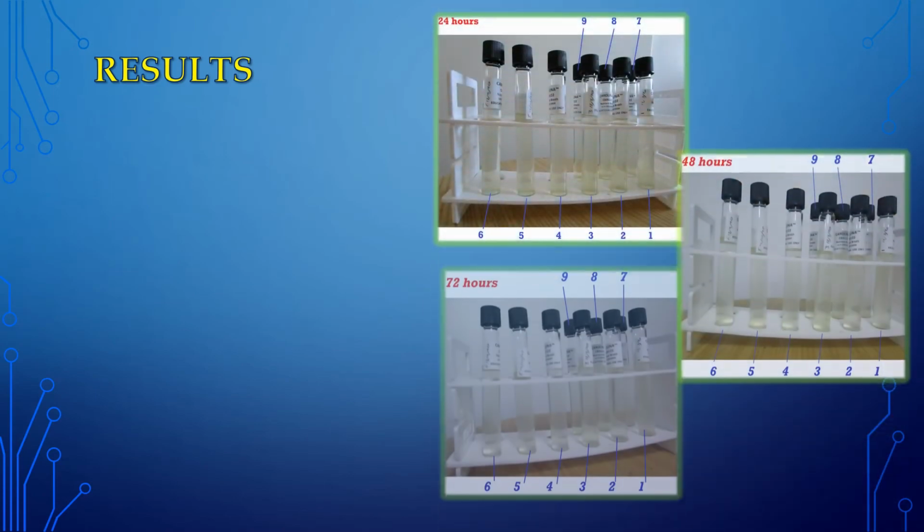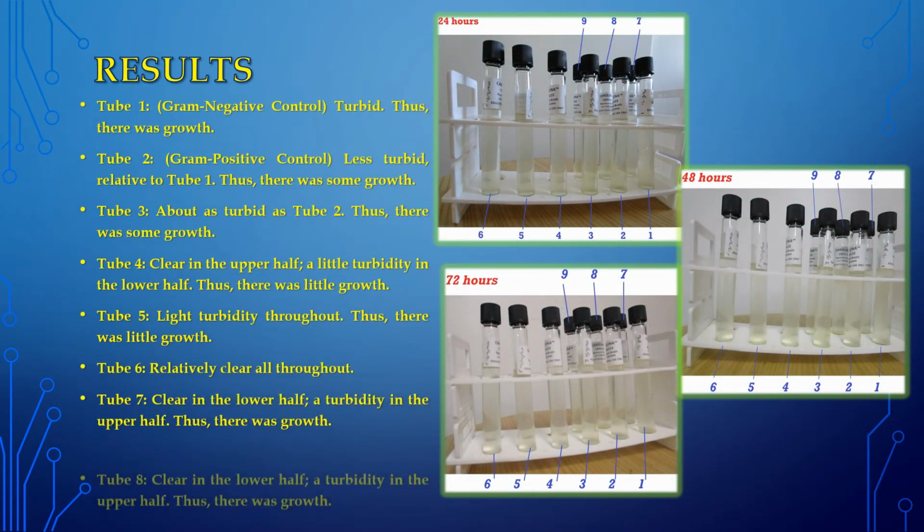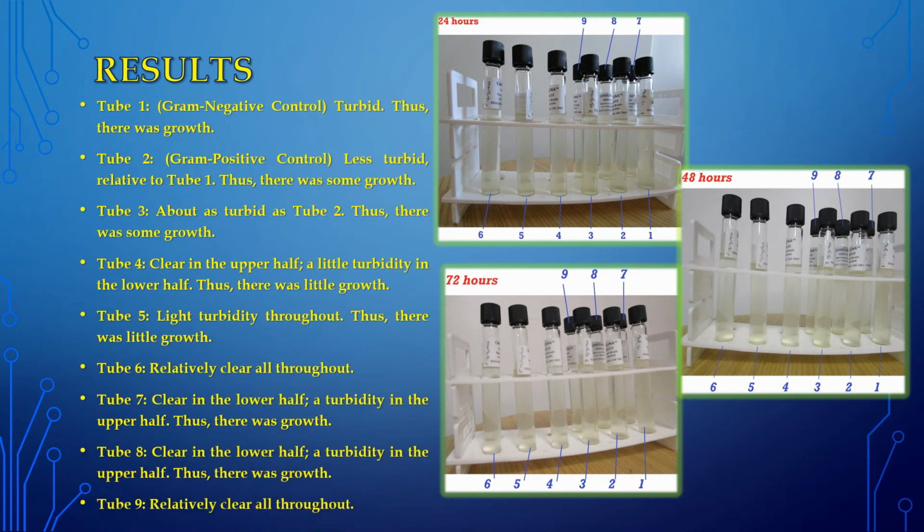Here are my results. Here are the pictures that I've taken after approximately 24, 48, and 72 hours. Here's what was exhibited in each tube, and now I'm going to decipher them right here in the discussion section.